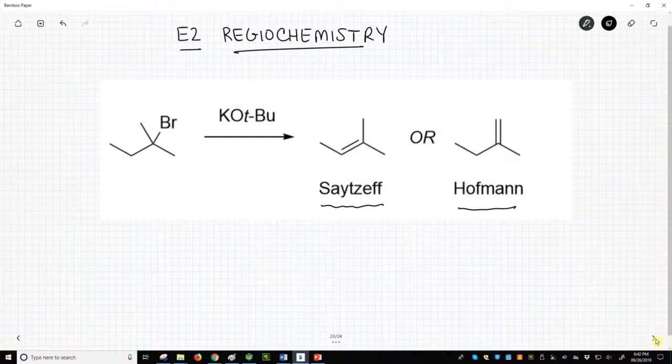To determine who is right, you both go into lab to perform the experiment. With great skill, you manage to isolate the product and take an NMR. Let's see the spectrum.